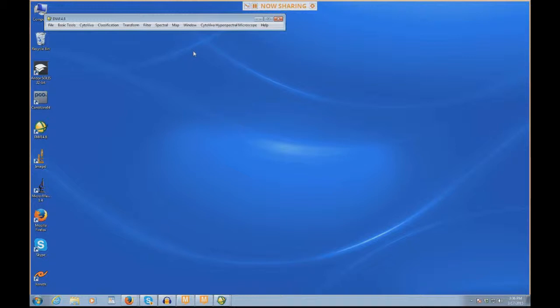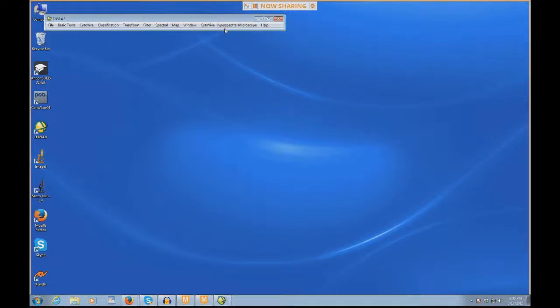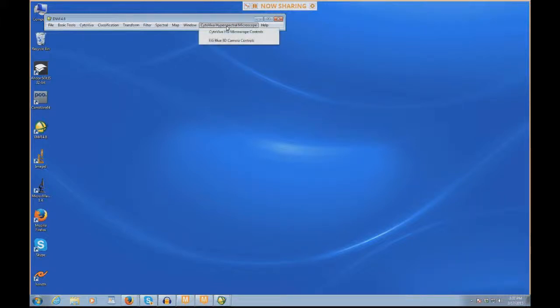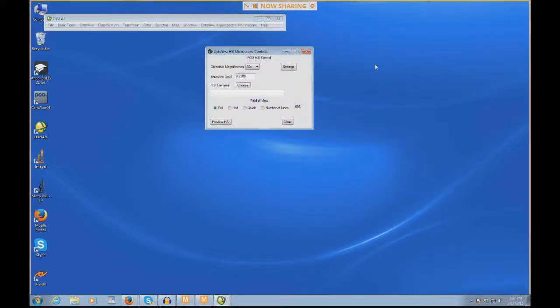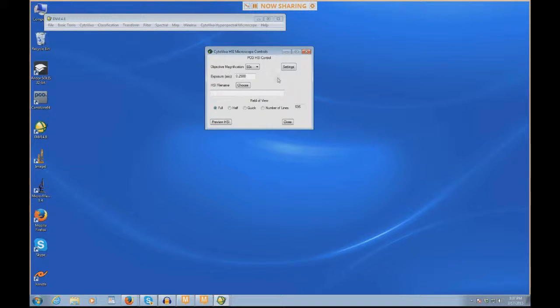This is the main Envy tab. In this control tab, we have lots of different options. Over here to the right, we have CiteAviva hyperspectral microscope. We click on this menu item and activate CiteAviva HSI microscope controls. After a couple of seconds, the microscope control dialog opens.